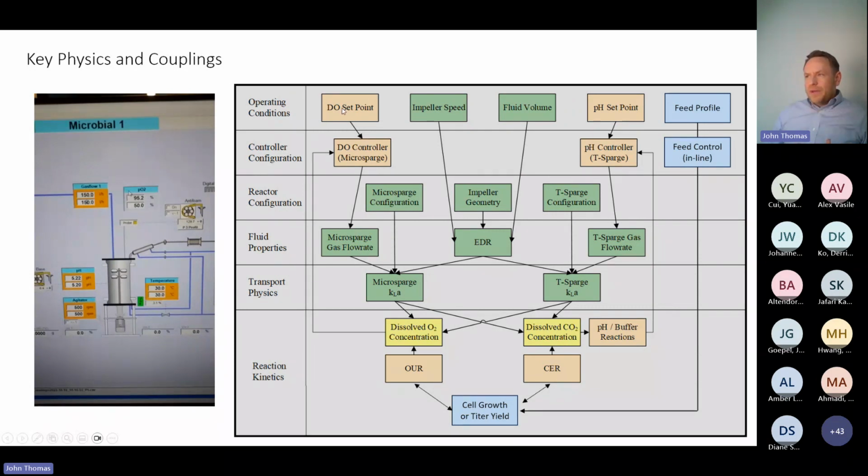So all the way up here is what we control, and that's to go through this Plinko daisy chain of all these interlinked reactions that inform what we want to see. And again, I'll harp on that point one more time. We don't set a growth rate. We realize a growth rate as a function of the operating conditions we set.